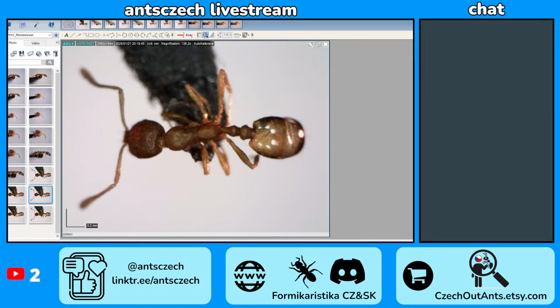Okay, for a second I thought I put the location differently, because in my observations I had the same species I saw now in pictures from different locations, but I also got a Solenopsis in that area, and yeah, that wouldn't have made sense.